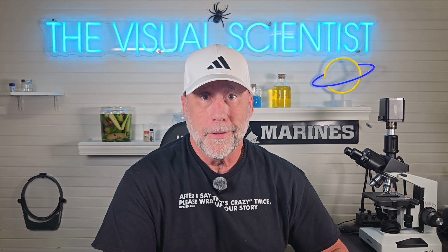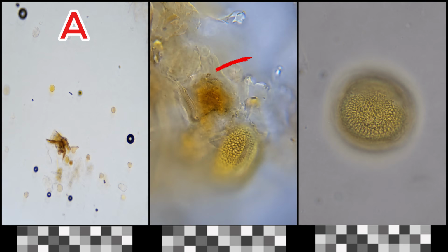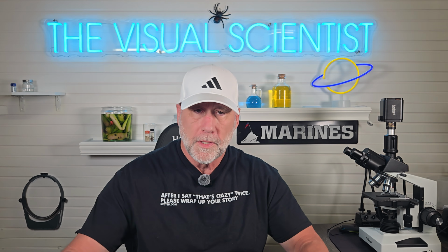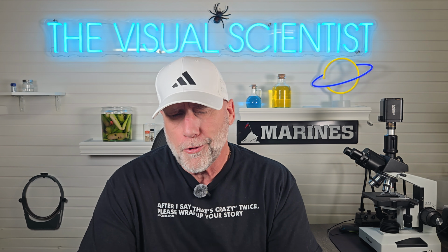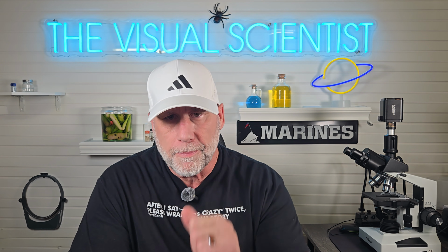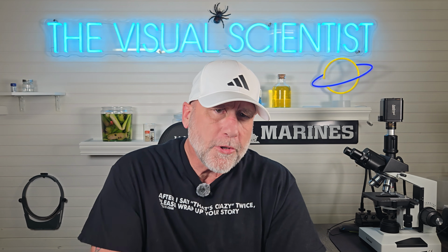All 3 slides are done. Let's put them side by side. Evidence A, left. Evidence B, center. Evidence C, right. So you've been watching these slides for quite some time. You've got your votes in the comments, or don't you? You better. Before I flip these jars, I need to explain something, because without the science, the reveal doesn't land at all. Let's go to the whiteboard.